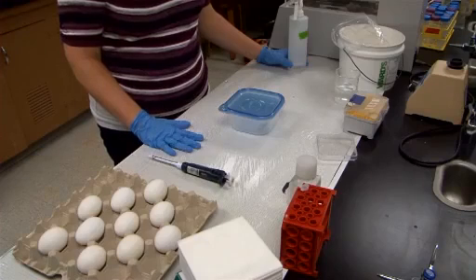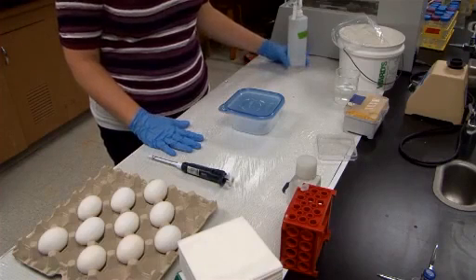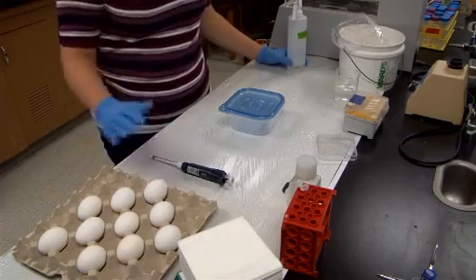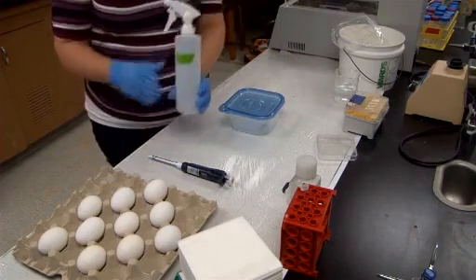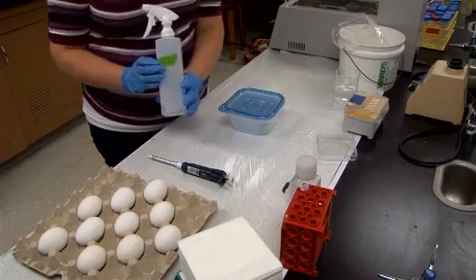The eggs have been incubated at 37 degrees Celsius with 40% humidity for approximately three and a half days, which roughly correlates to Hamburger and Hamilton stage 19.